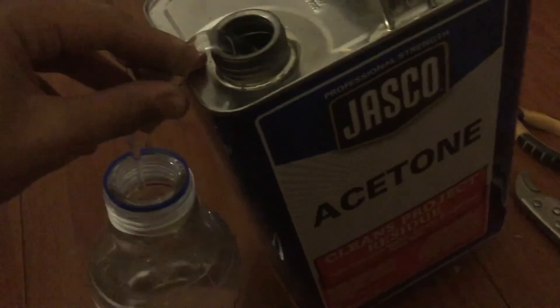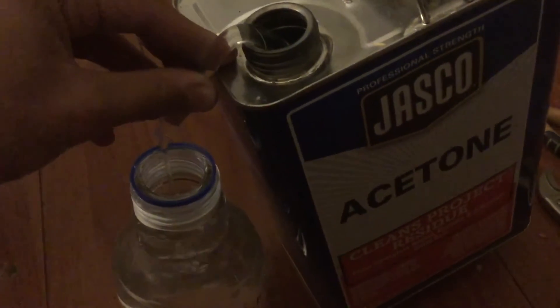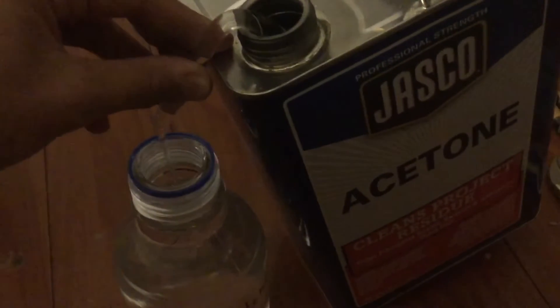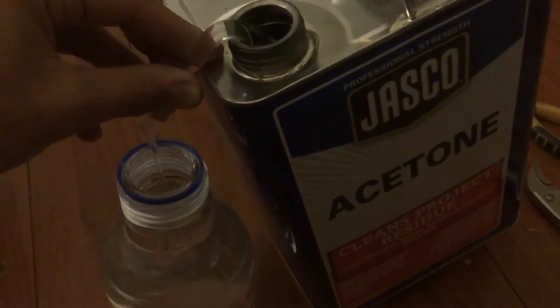To slow the flow a bit, I've angled one side with the cap of the bottle. You can see it's about full now — almost completely full — and I'm overfilling it because I also have a smaller bottle I want to fill.